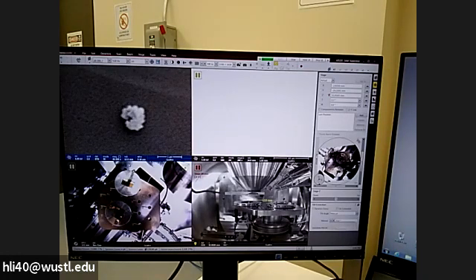And what's the meaning of working distance? You know, for the SEM, we need to shoot the electron beam on the sample surface. We have to focus electron beam to a point. How good the point is affects your resolution. So that focus distance from lens to the point is the focus. So that point is on your sample, then your sample will be in focus. So, okay, so now we adjust the focus and we know the lens to my sample surface is 12.5 millimeter. My sample is in focus. We are going to test the software. This is called link. So we test software, my sample in focus at 12.5.